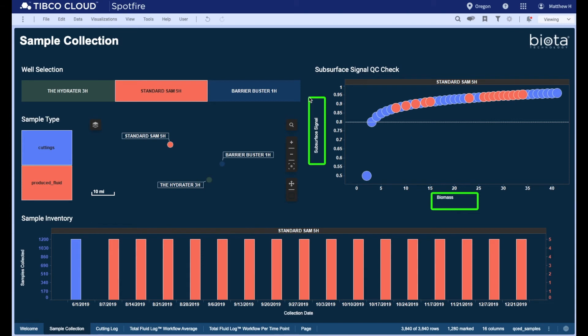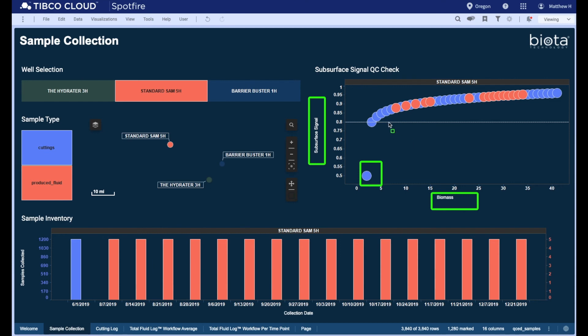Most Permian projects will contain a majority of well cuttings passing this 80% DNA subsurface signal cutoff, which produces the highest confidence results. We can see here that a single well cutting fell below our 80% cutoff, and that 100% of our produced fluids in orange passed the 80% subsurface cutoff.